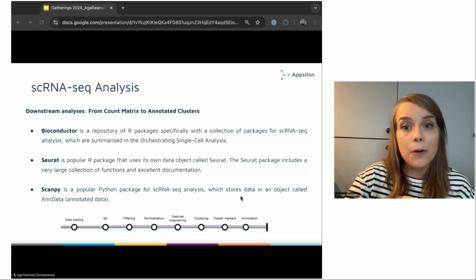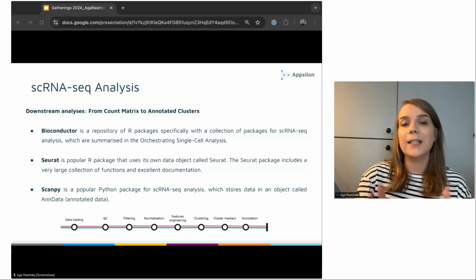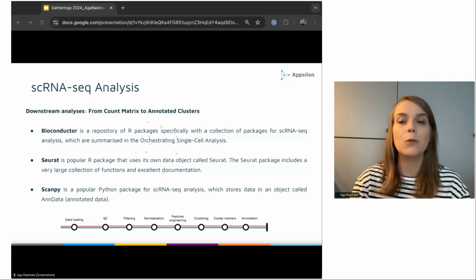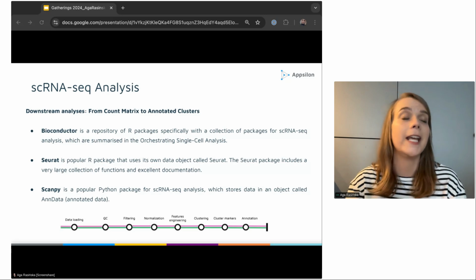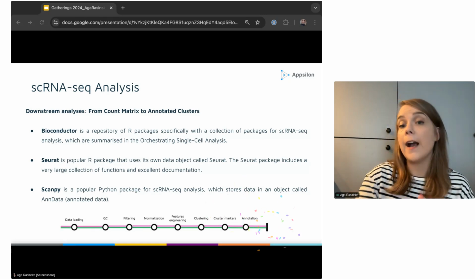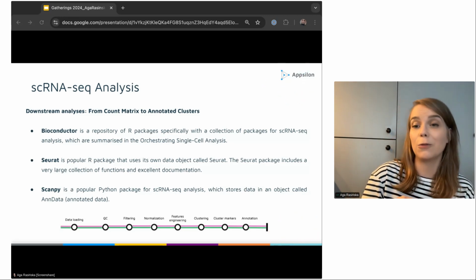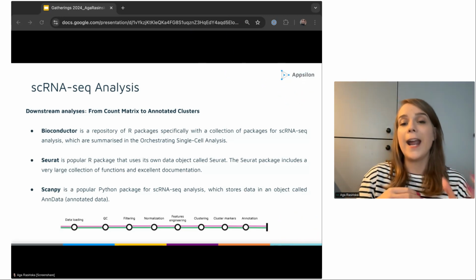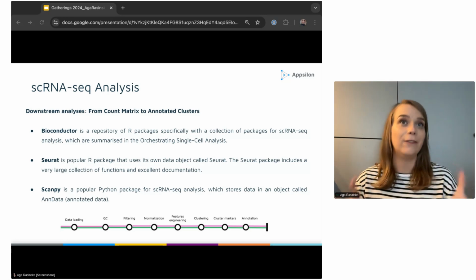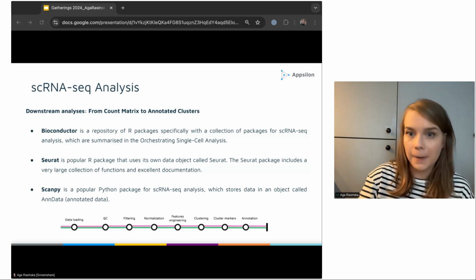And what's more is the idea of reproducibility when it comes to including all of those steps and running them multiple times, sharing the data, validating the data. So as you can see, I hope now you can see why I chose single-cell RNA-seq for today's journey, as we have multiple spaces where we can take advantage of the context and idea of data pipelines.